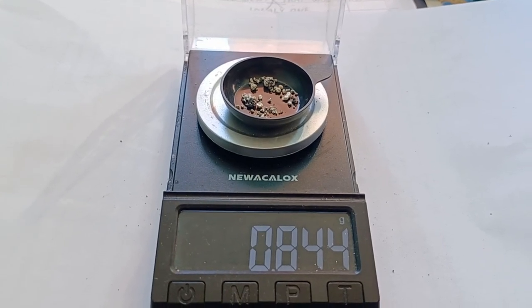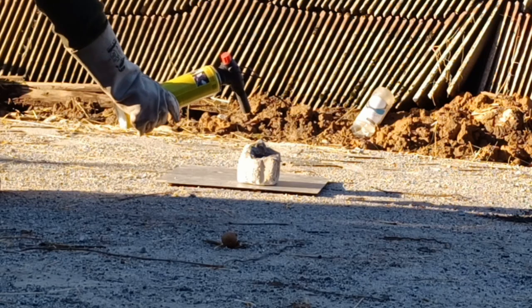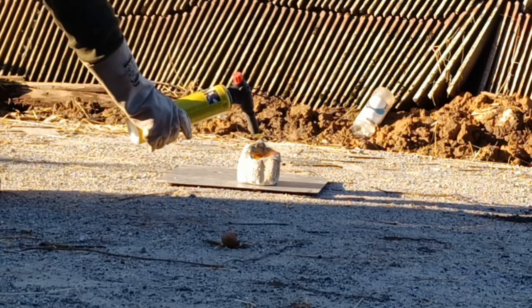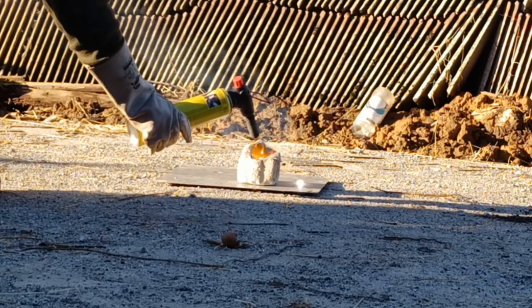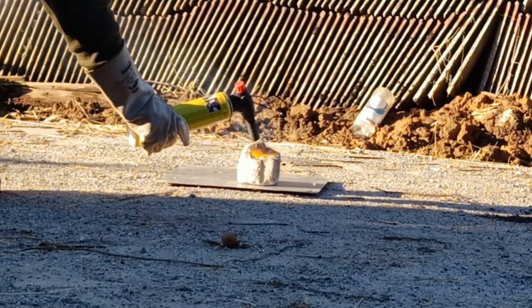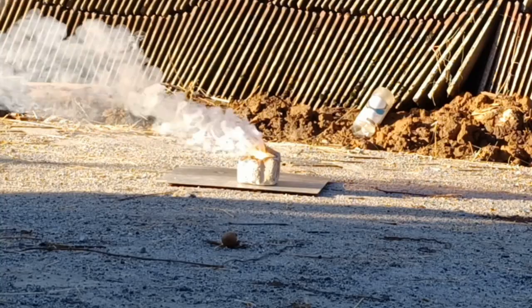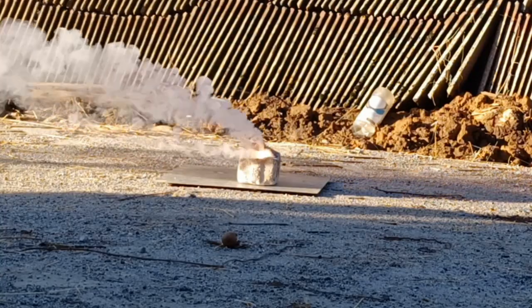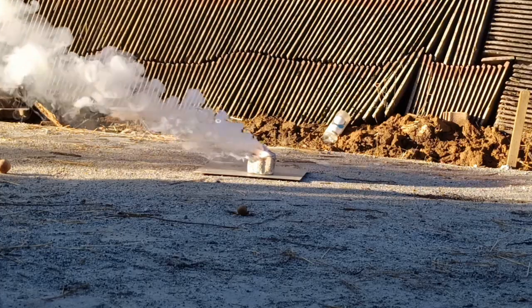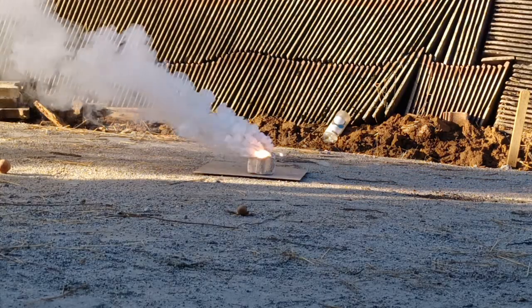Before we move to conclusions, I believe there is time for one ignoble mention: silver thermite. If you wish to vaporize 100% of your silver, you can mix silver oxide and aluminum. The reaction is not practical — I did it to celebrate the silver price reaching 1 euro per gram.